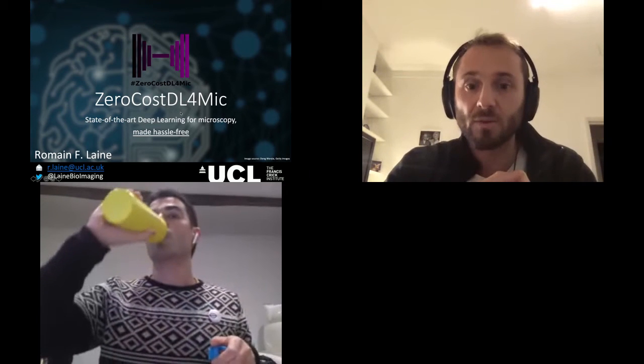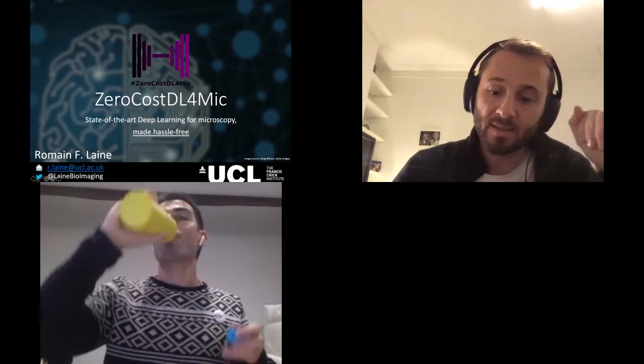As you've seen from Ignacio just now, it's absolutely clear that deep learning has enormous strengths and potential for bioimaging. But the bottom line is it's still difficult to use, and the tool that I'll be presenting today, ZeroCostDL4Mic, intends to make this a lot more accessible, a lot more hassle-free.